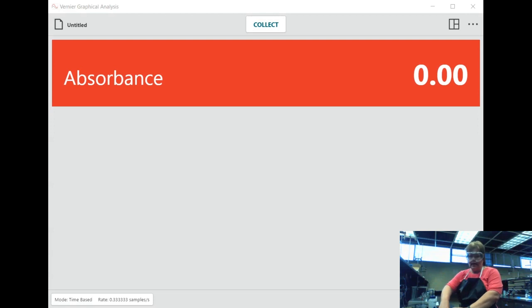Now I can move it. I don't really care about the water's reading. I just needed to zero it with this wavelength. I've now taken my stock solution, my strongest concentration solution, and put it into the cuvette. I want it almost up to the top. I'm going to add a top, clean the clear sides, and turn it.